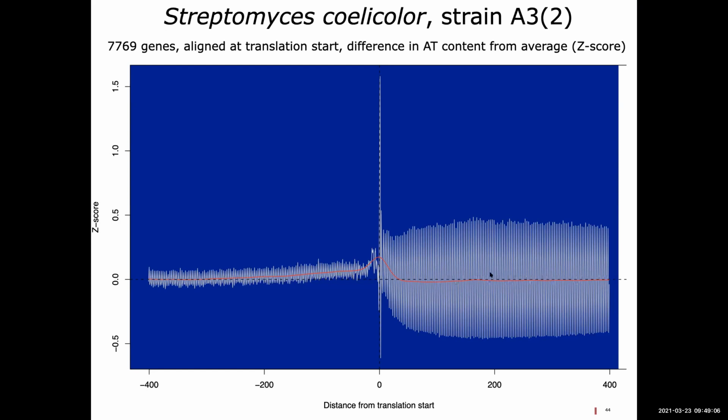Did it just run into a bigger G? I don't know. So you're looking at differences in A's and T's, looking at AT content differing from the average. Remember I said the organism is GC rich, because the codons for amino acids all require an A. So whenever you get to a coding region, you're going to have more A's and T's than C's and G's.